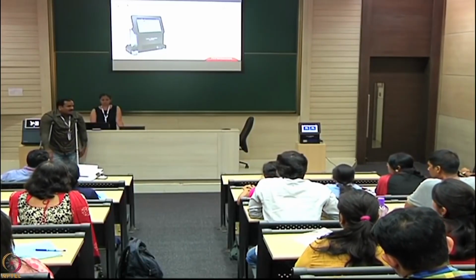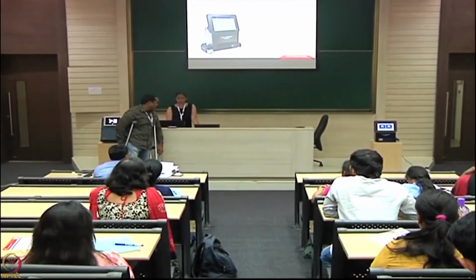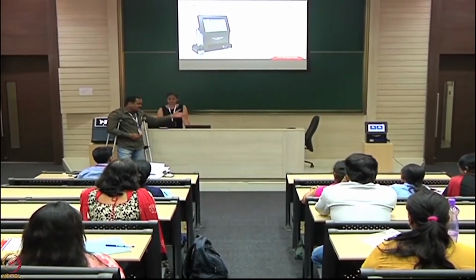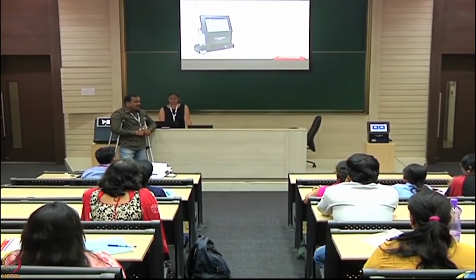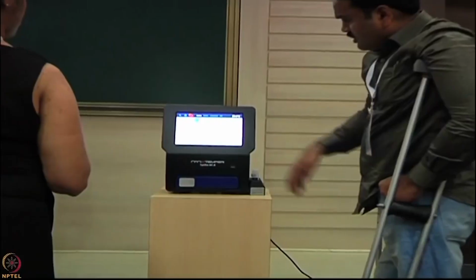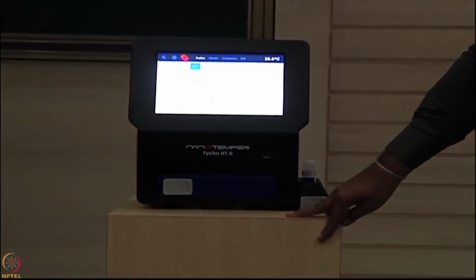It's more mass spectrometry. Fine, so that's all. Quickly, maybe 3 minutes as I said, she will load 1 sample quickly. By the time she comes here, the time will be done there. So you just load 1 sample. We are just showing the previous data to get an understanding because we had only 1 BSA.